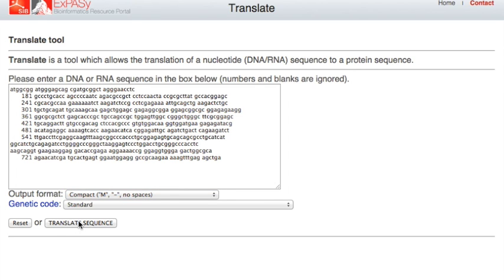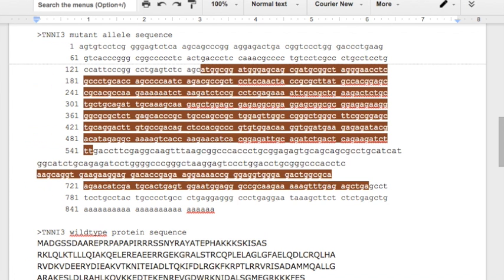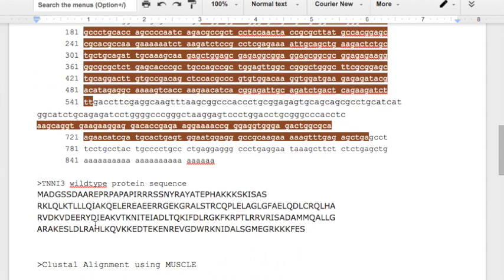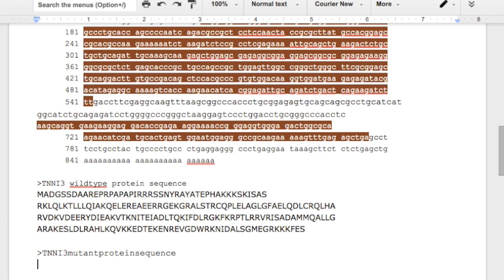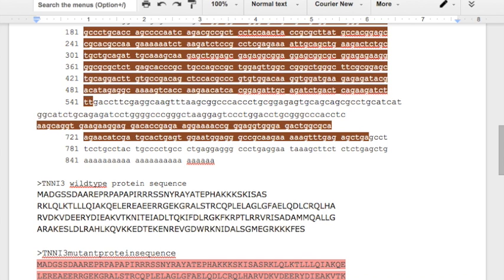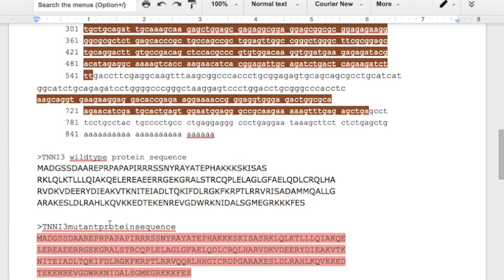Collect that. Let's paste that in. TNNI3 mutant protein sequence. Paste that in. At first glance, it's not exactly obvious what the difference is between this sequence and this sequence, so let's just take them and align them.